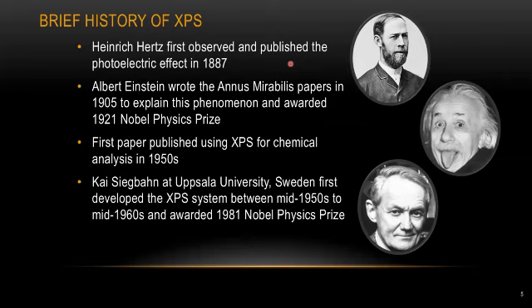So here's a brief history about XPS development. The main principle behind the XPS measurement is the photoelectric effect, and that was first observed by the German scientist Heinrich Hertz back in the 19th century. Then Albert Einstein wrote a paper in 1905 to describe this phenomenon, and it awarded him the Nobel Prize in Physics in 1921. The first paper published using XPS for chemical analysis doesn't happen until 1950.